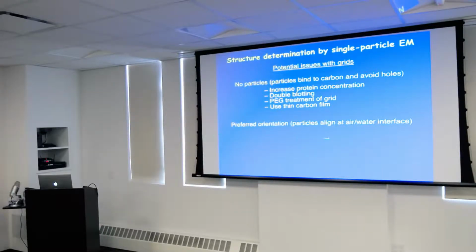So what is actually interesting, what Alex did here, is to look at single particle specimens. And usually we just put them into the microscope and we take 0-degree images, and we find that all the particles are on the same orientation. And we never really knew why. We always assumed it might be because they're attached to the air-water interface.